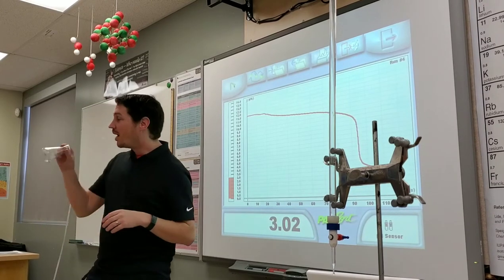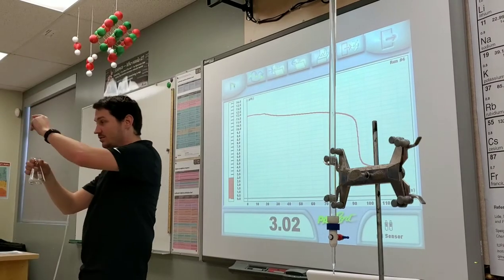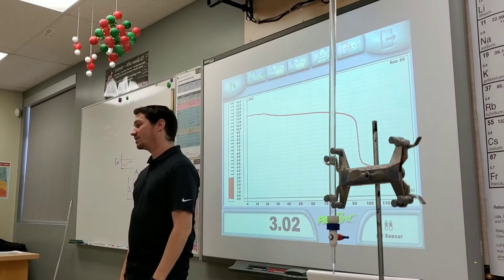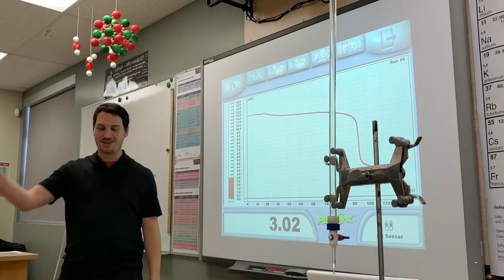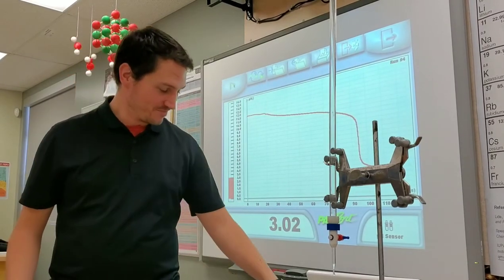Thank you. By the way, using your dominant hand to swirl and using your non-dominant hand to do the titration is actually the better way. It's the more accurate way of doing it. Okay? Because I need to run this program at the same time. Come on, why would you ask me that? That's a great question to ask, by the way.